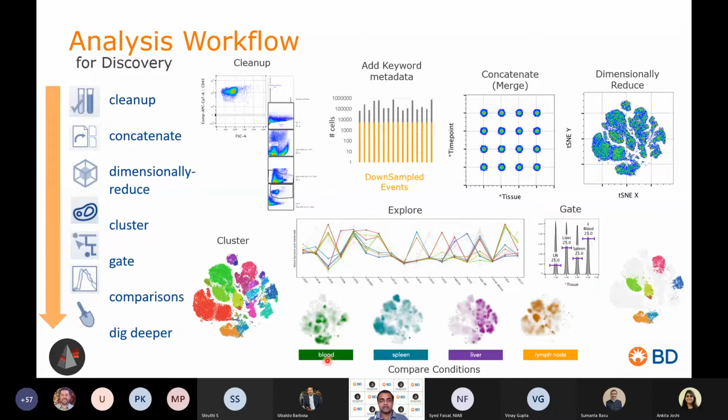You can have an overall idea of any particular area or population of cells which is getting elevated or depleted, enhanced or depleted. For example, this is a density plot, and you can see this particular cluster is getting enriched in the spleen compared to other tissues. And again, this one is getting enriched in the blood, but not as such in other tissues, maybe a little bit in liver.